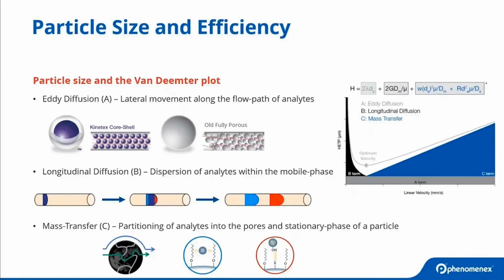And so within chromatography, we borrow that term and refer to it as theoretical plates. You can think of a theoretical plate as an interaction between the analyte and the stationary phase. Within a set column, the more theoretical plates you have, the shorter the distance between each of those theoretical plates.